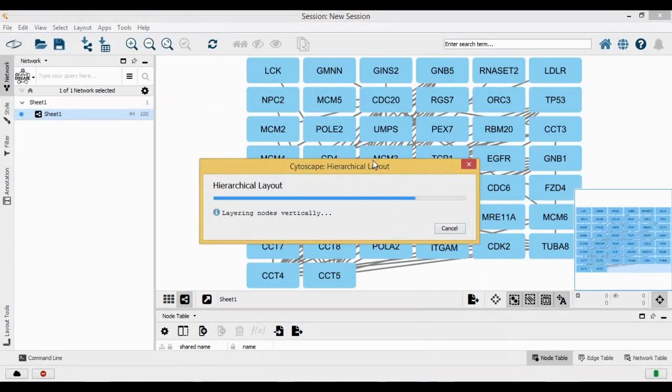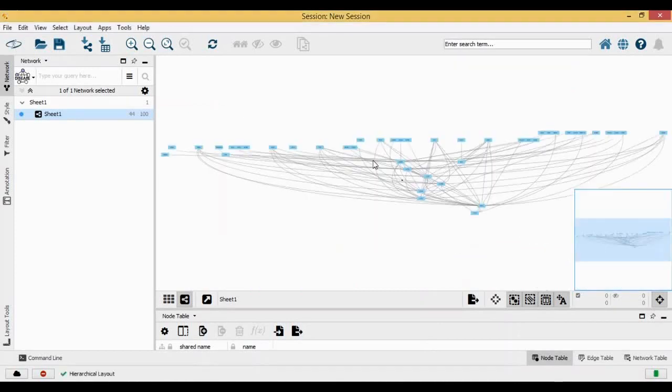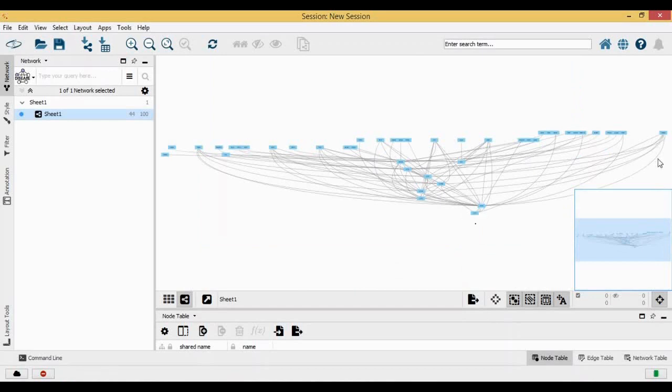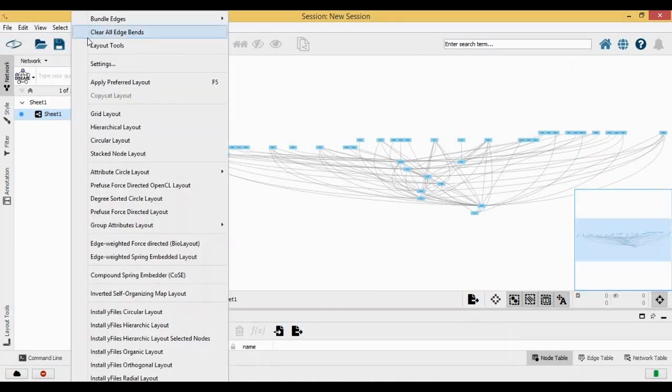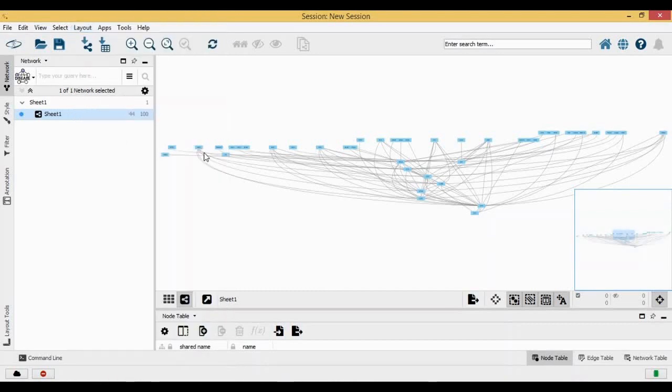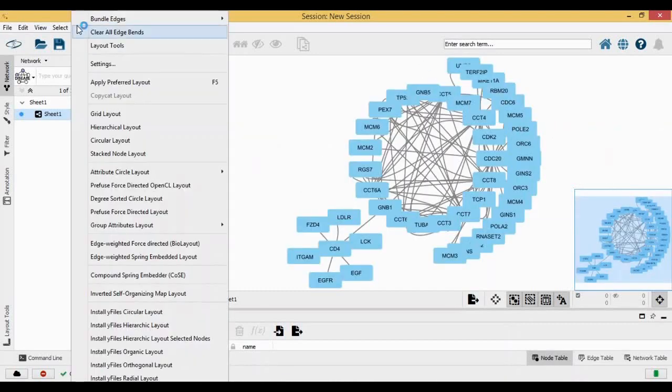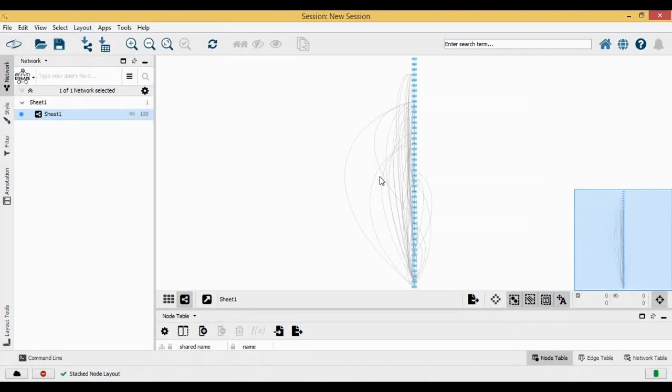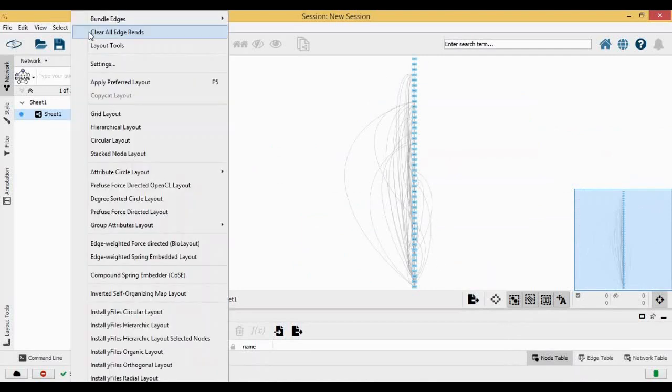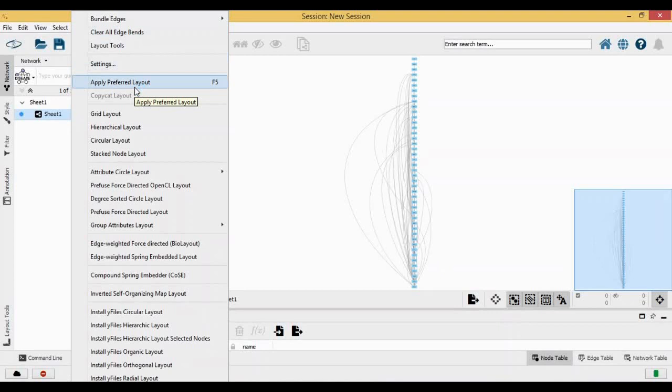It gives me the hierarchical representation with the root and branches. Then I have the circular layout, so it gives me in a circle form. And then I have this stacked node layout which is there.